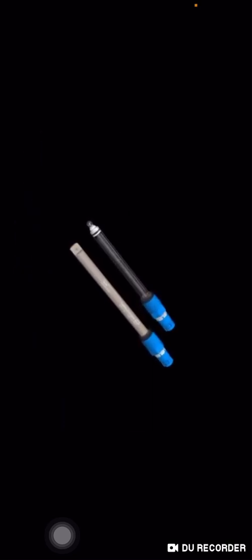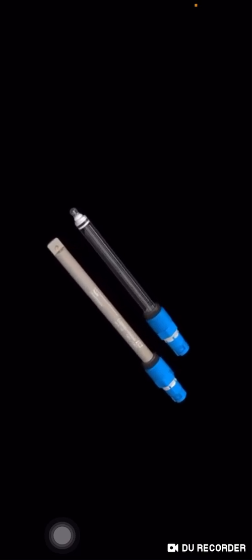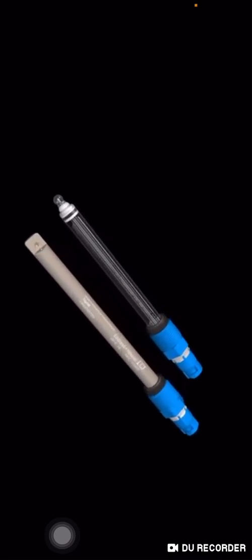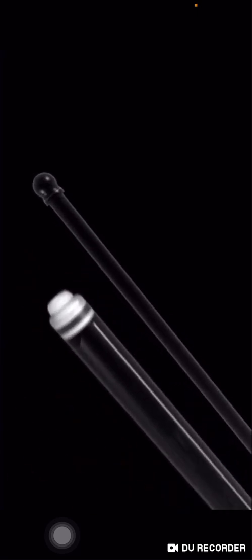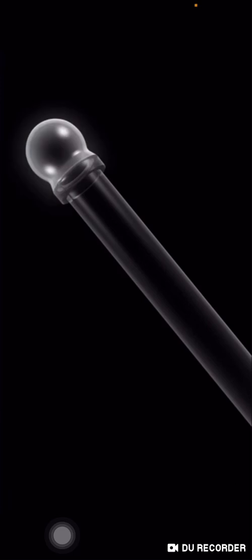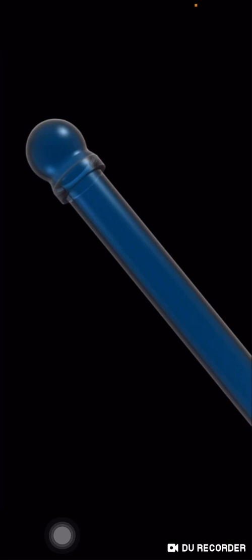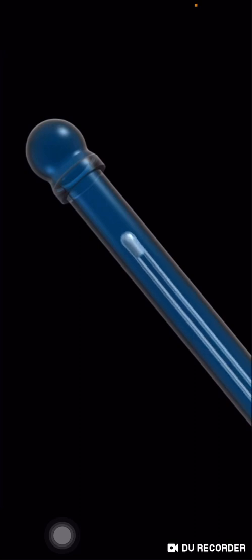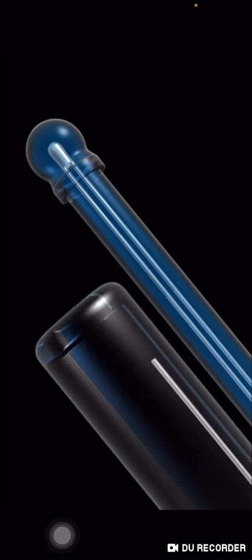According to the potentiometric principle, pH measurement is the measurement of potential difference using so-called glass electrodes or non-glass electrodes. In the case of glass electrodes, the pH-sensitive element is a glass bulb that is fused to the end of the glass tube. The electrode is filled with a neutral potassium chloride solution buffered at pH 7 and contains a silver chloride wire that forms the electrical connection.